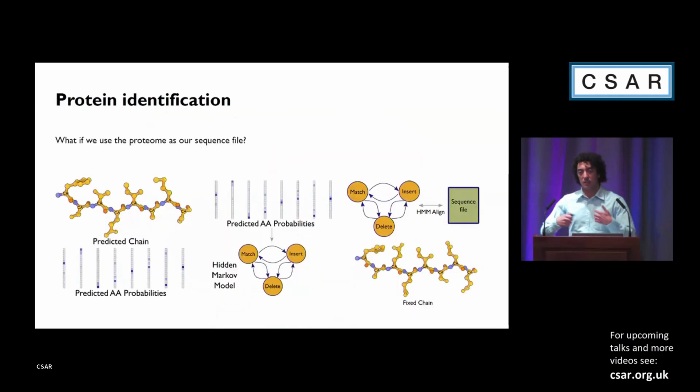And so this was the main part of my project, to just automate what people had been spending months to do. But then we realized that we can actually do better than that, and we can solve a big problem we have now in cryo-electron microscopy, which is, it's fine if you have a protein in mind, you express it in bacteria, you purify it, and then you solve the structure.